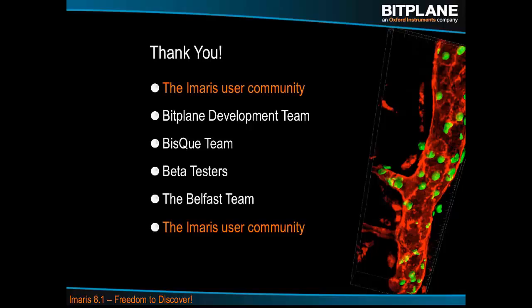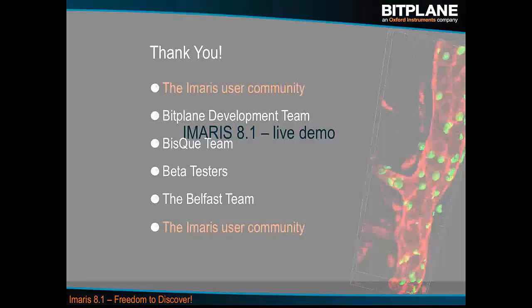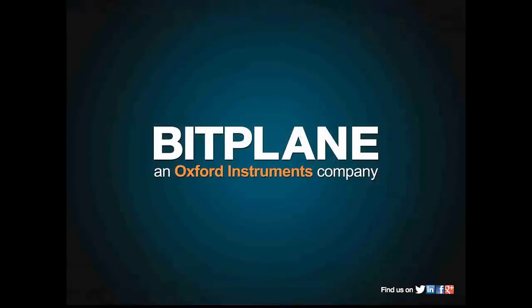I can't take questions, seriously. Or if you want, I can show you a couple of things in Imaris itself. Just pull the chair around. How you import experiments into existing experiments? You do batch surfaces and join with another batch of spots, something like that.